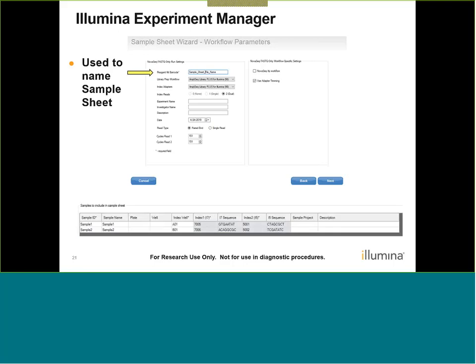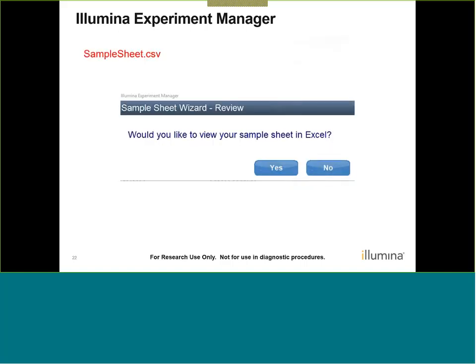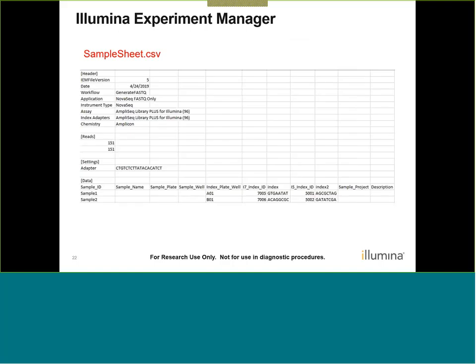Clicking Next brings you to a window where you can fill out the sample information. Any value that contains an asterisk is a required field. We're going to input the sample ID and specify the index 1 (I7 index) as well as index 2 (I5 index). You can then click Finish, and it will ask if you'd like to view your sample sheet in Excel. The sample sheet is a comma-separated value file, and Excel helps keep all information displayed in the appropriate columns.